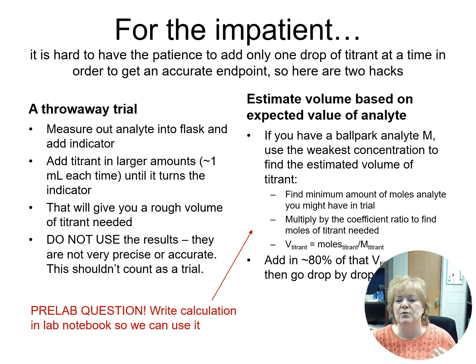Okay, so you've done a titration before. You remember that it's really complicated because I start with acid in my flask and I put base in the burette, and it could be flipped, it doesn't matter which one. I'm going to add from the burette drop by drop, and I want to get to a point where with one drop it changes from clear to pink because we're using the phenolphthalein indicator. And that is really tedious because you're going drop by drop for tons of milliliters. It's about 20 drops in a milliliter, probably even more, more like 40 on our burettes. So it's just too much time.